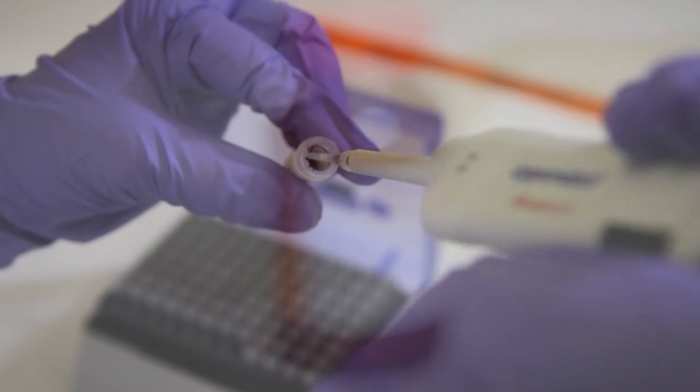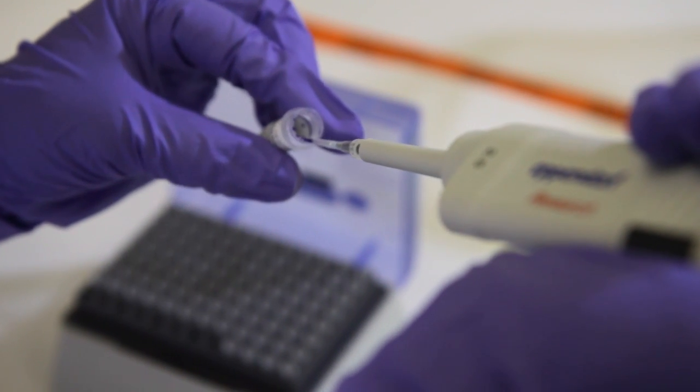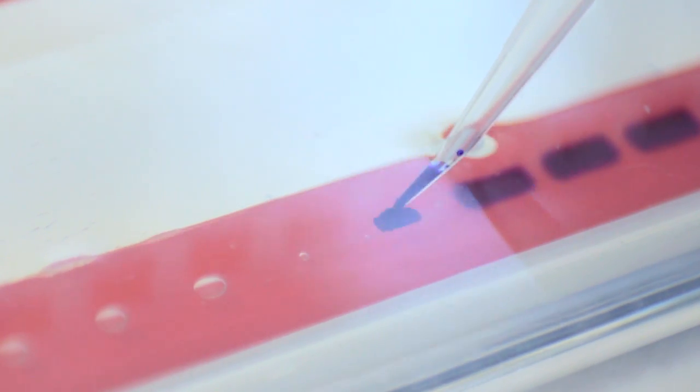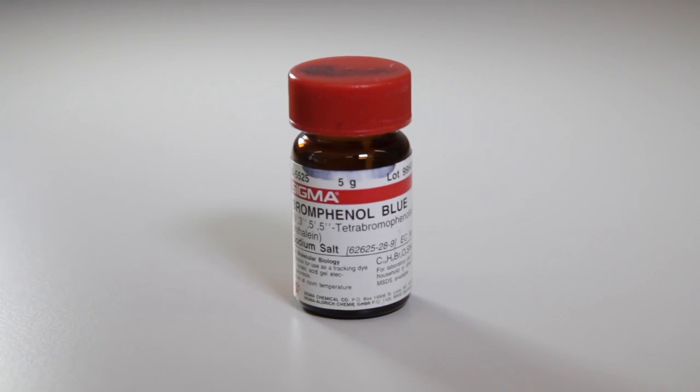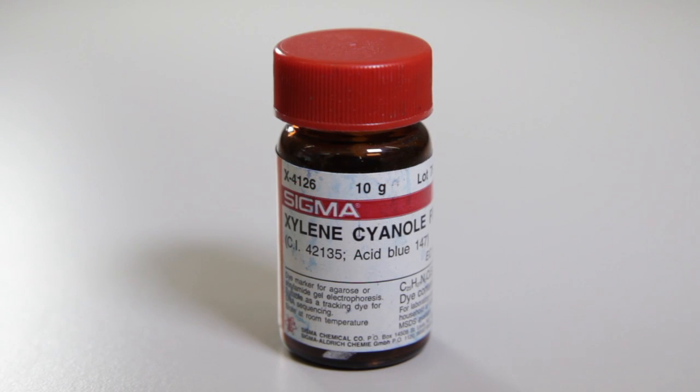The precise amount of dye is not important. Use about a 1 to 5 ratio with each sample. However, it is important that you don't have overlap of your dye and expected DNA size. For example, if you are expecting a band of 200-400 base pairs you shouldn't use bromophenol blue as it will run at the same pace and obscure your product. In this case you should use a larger dye like xylene cyanol.